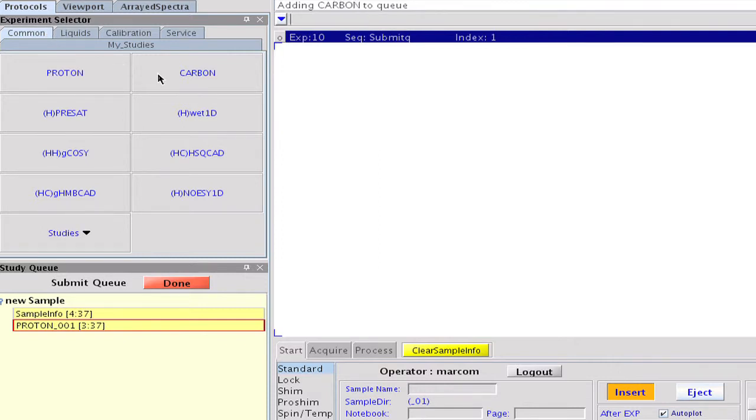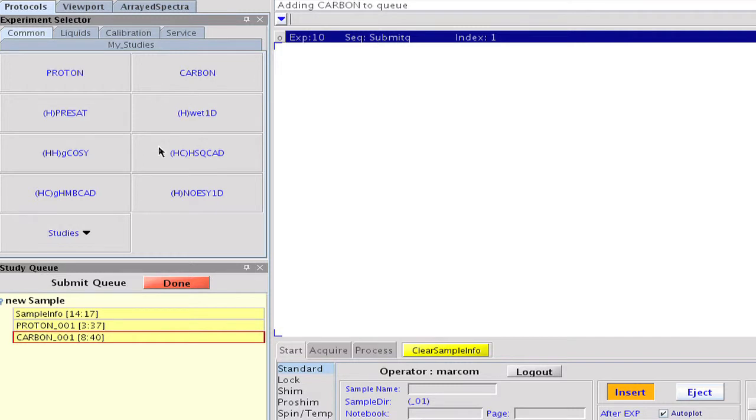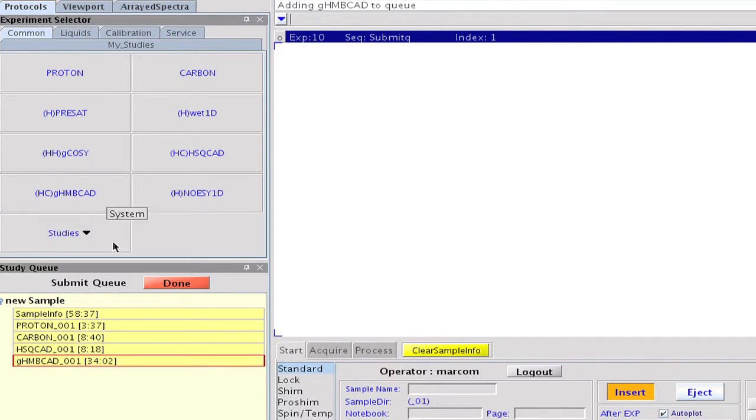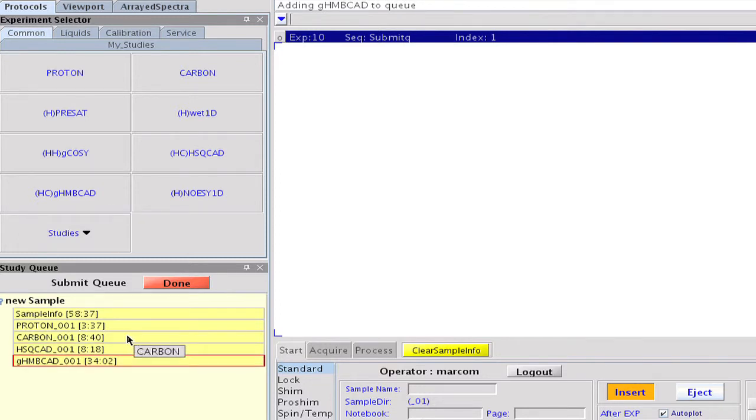We'll also add another couple of experiments such as carbon, a gradient HSQC, and a gradient HMBC with adiabatic refocusing pulses to our study. Each of these experiment nodes can be customized as we'd like.